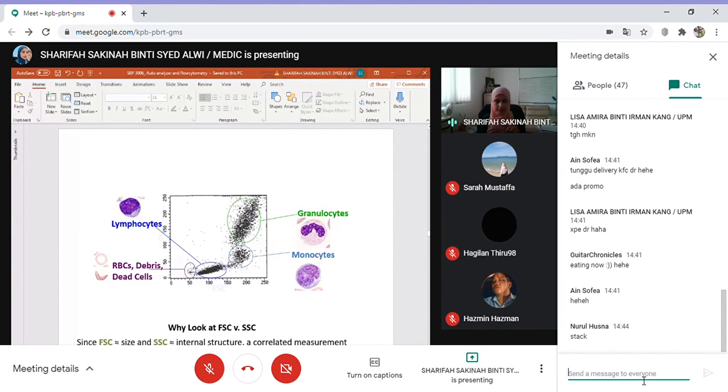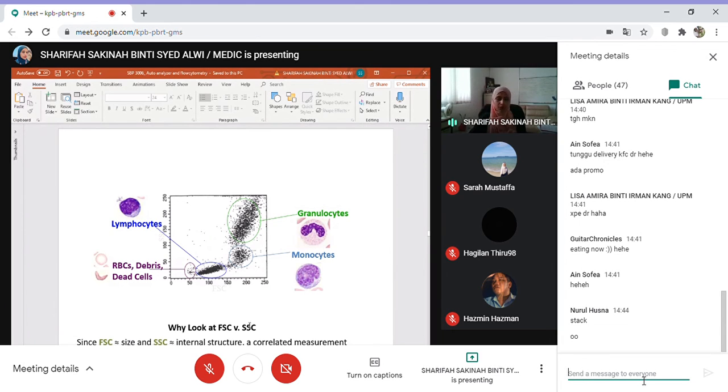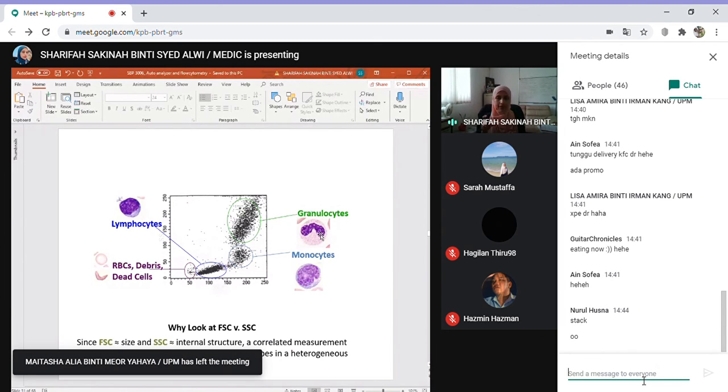Why is that? Because for monocytes and granulocytes, you also have to consider what happened to the live cells.